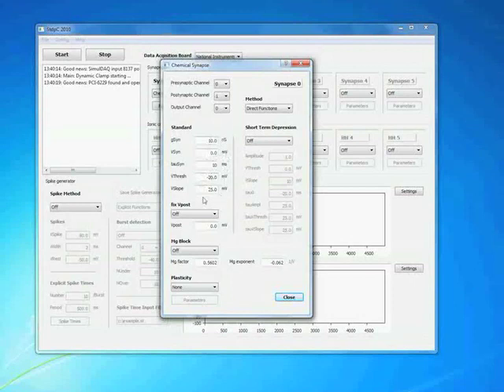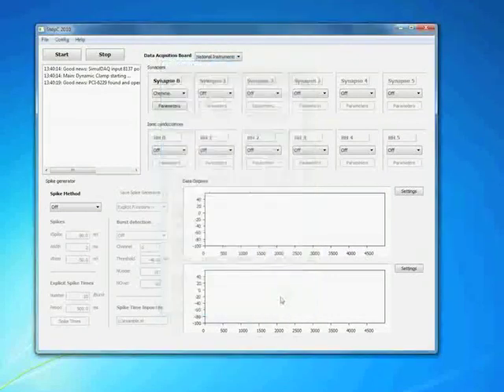Then there are several advanced features in here which I'll leave alone for now. We can fix the postsynaptic potential, we can introduce a magnesium block, we can use short-term depression, and we can use plasticity. All things that we have not discussed in this basic protocol, but which are explained in detail in the manual to StdpC. If I hit close, that completes the configuration.